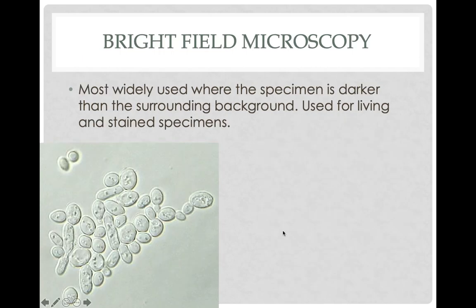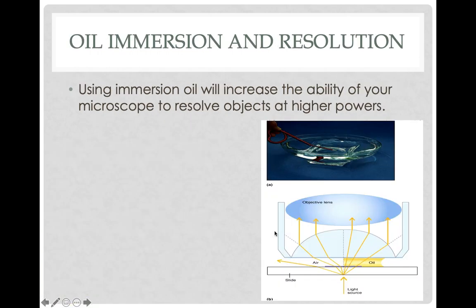So one of the things that are used a lot in microbiology labs is oil. I will refer to the 100x, the oil lens that's eventually the one that's got the 1000 magnification, as the oil lens. And most people do as well, the oil immersion lens. Oil is used a lot in a microbiology lab to help resolution, also to increase the light that comes into a microscope.